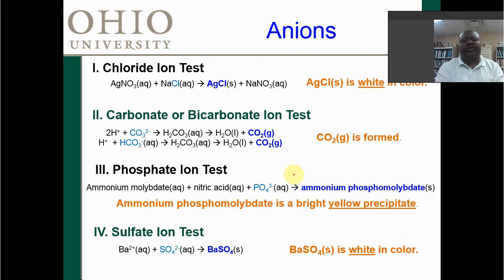All right, so chloride. How do you identify chloride? Well, it turns out that for chloride in this case, you can identify it by adding silver nitrate. So first you must take chloride, which will come to you as a solid, dissolve a little of it in solution, so you have NaCl aqueous, and add AgNO3 aqueous, silver nitrate.